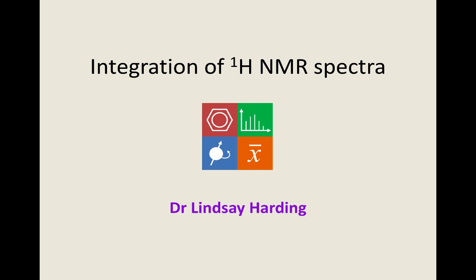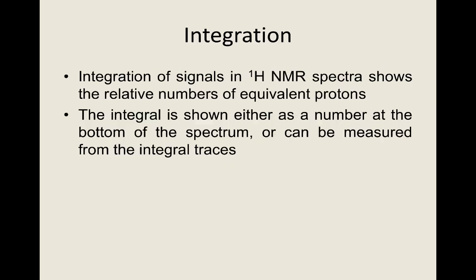Hello and welcome to this screencast which explains how to integrate signals in proton NMR spectra.